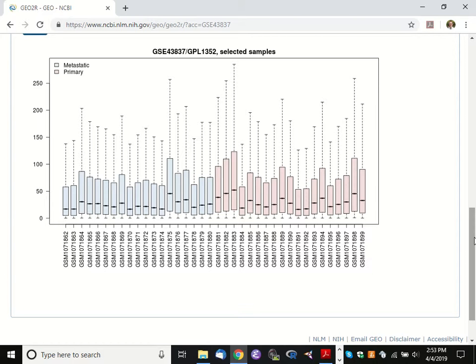If the difference is huge, well, you can get away with a lot more variability. So generally speaking, we would like to think that the variation we see is not a huge factor. What we see is that from a normalization perspective, there's probably a bit that could be done to make these data look more like each other across the board. Hopefully the software is going to have a bit of a normalization model internally that will take care of that.